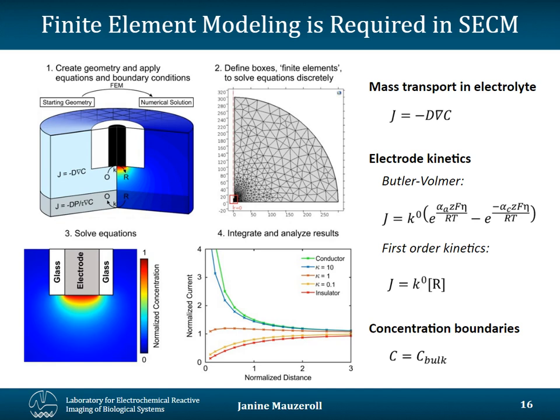You see that you have the microelectrode on top. You have a species that's undergoing an electrochemical process from O to R at a certain rate. You have the electrolyte, in which you will have concentration profiles. And you have the substrate in gray that will also have a certain rate at which the reaction R to O is going to occur.